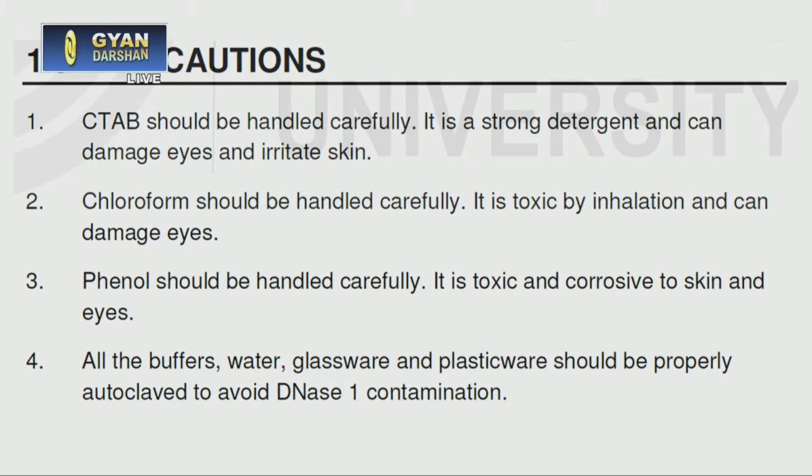Now, what are the precautions that you need to take for these experiments? CTAB should be handled carefully, because it is a strong detergent; it can damage eyes and irritate your skin. Chloroform and phenol, both of them should be handled very carefully. Chloroform is toxic by inhalation and it can damage the eyes. Phenol is toxic and corrosive to the skin and eyes.